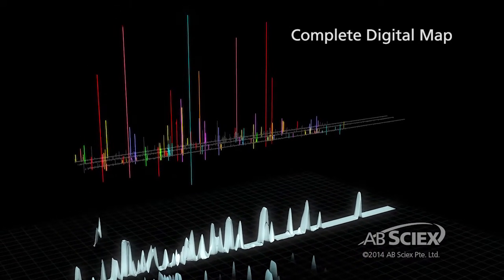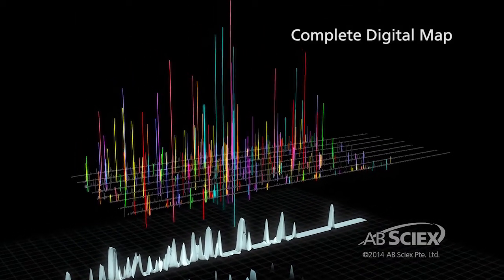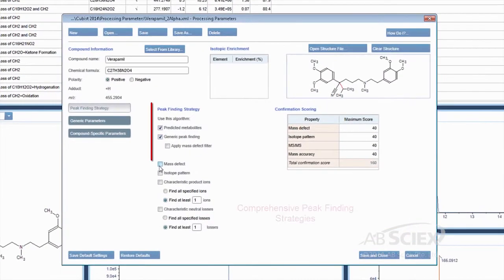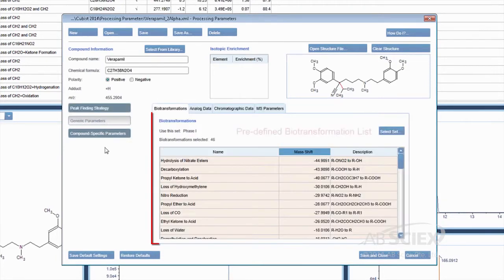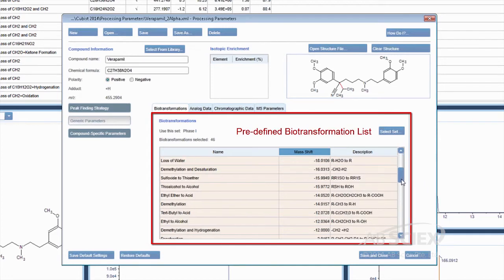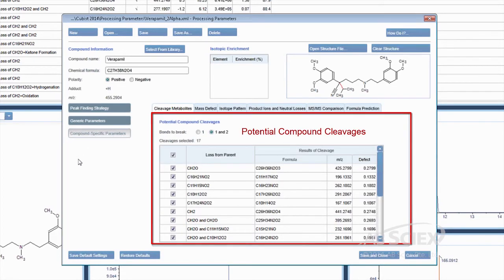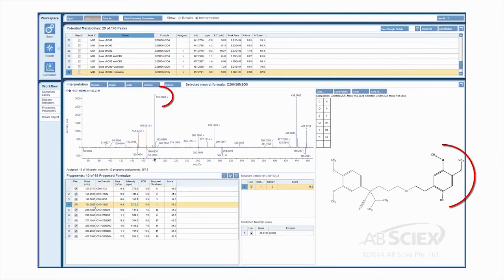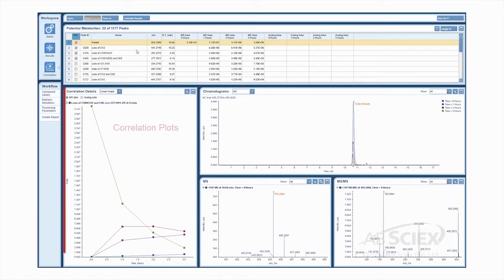Data files created using SWATH acquisition are available for both quantitative and qualitative investigation, providing high quality product ion data for all detectable analytes in the sample. MetabolitePilot software utilizes sophisticated peak finding strategies and scoring algorithms for automated metabolite detection. Predefined biotransformation lists target predicted metabolites and structure-driven algorithms identify and detect hard to forecast cleavage metabolites. Confirm assignments and distinguish isomers using integrated structure interpretation tools. Results evaluate metabolic stability or view multiple experiments with correlation plots.